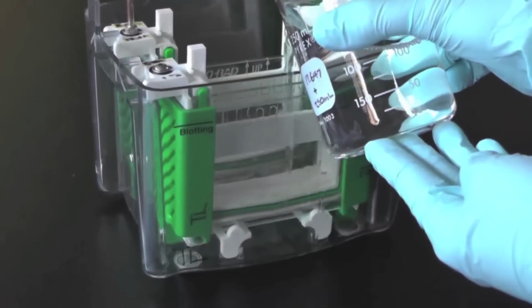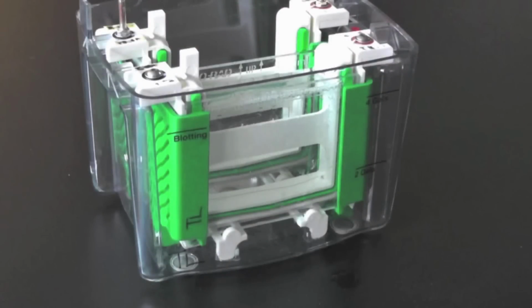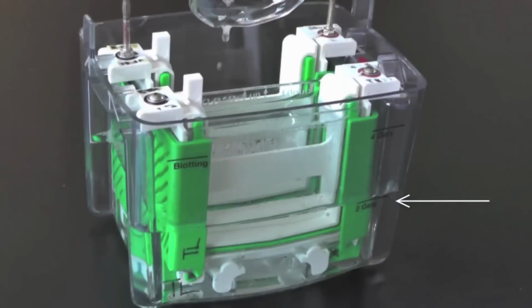Pour the 10 times diluted running buffer solution into the running module between the two plates until wells on the two plates are fully submerged. Check to make sure the running modules aren't leaking any buffer solution into the tank. The tank only needs to be filled halfway with the buffer solution if running two gels.